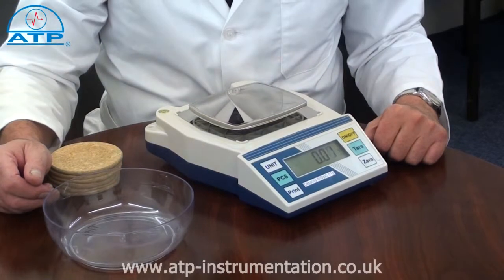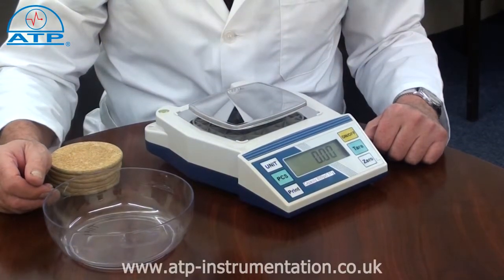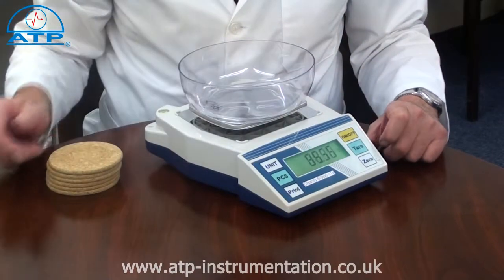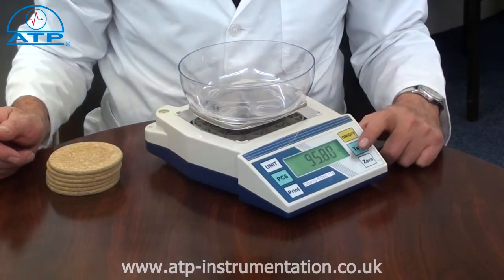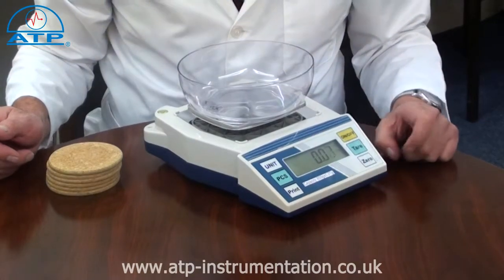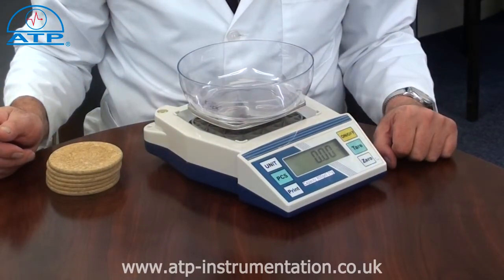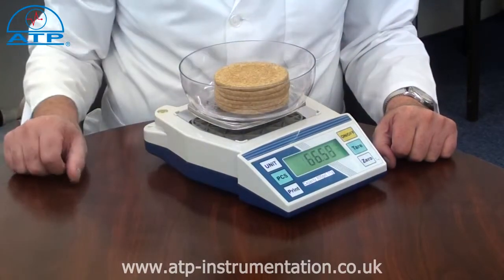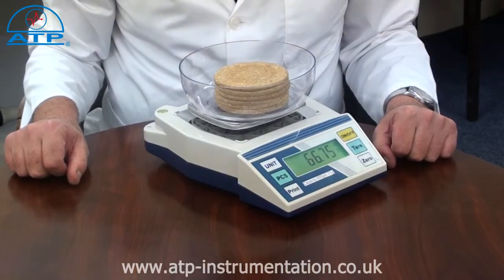The tare facility allows a container to be placed onto the platform. Press tare and the display value will be zero. By then adding contents to the container, the display value is the contents weight only.